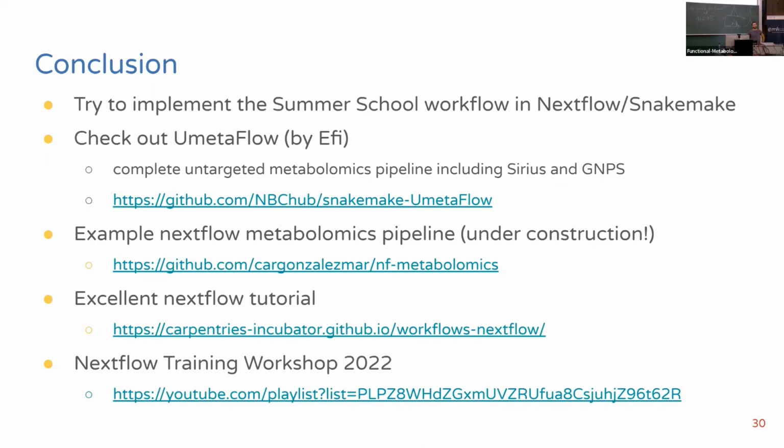Question about, you said when you have a different machine or a different experiment, you need to make your pipeline again. What is your experience if you use at least the same machine and use maybe different samples from different persons or different values? The same kind of samples, let's say blood samples and urine samples. You think you can keep the same pipeline?